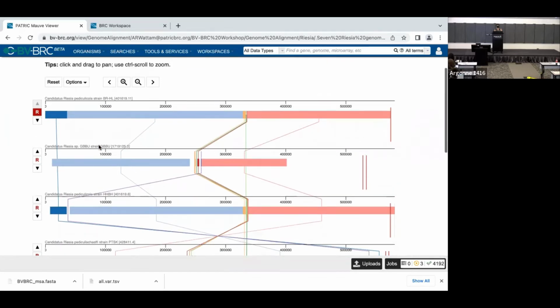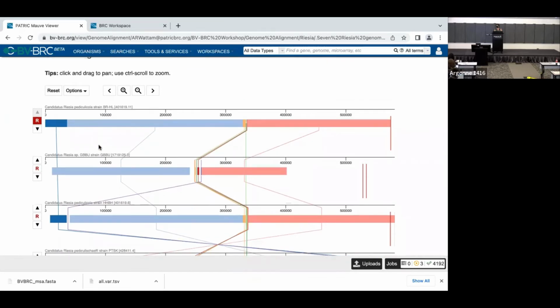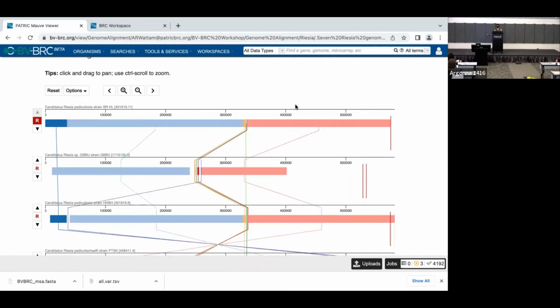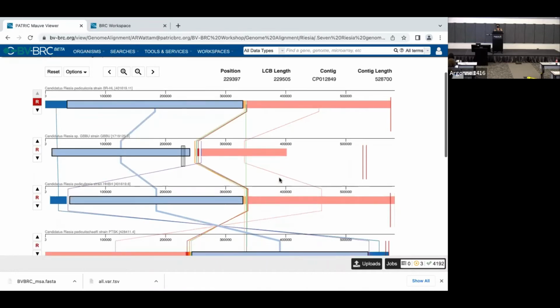And what's the difference that you see between these two genomes right away? One is big, one is much smaller, which is an indication that this guy has been throwing things off right and left compared to this guy. So the gorilla louse is not as needy as the human louse. So this endosymbiont, there's a lot of things that's just thrown off.